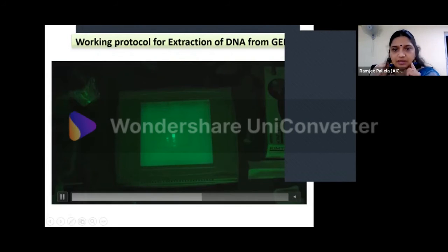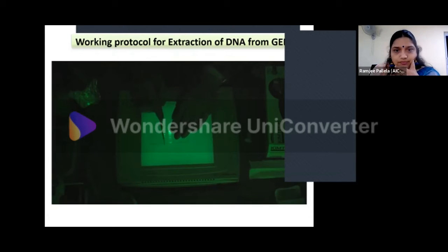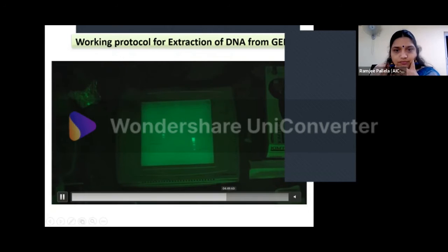See here, another gel. If you can see, this is the ladder, and these are our two bands. Now I don't want this smaller band, I want this bigger band. Okay, so slowly we will be cutting this bigger band. You see here. Remove whatever that you don't want and just take only the bands. Can you see this? Beautiful.